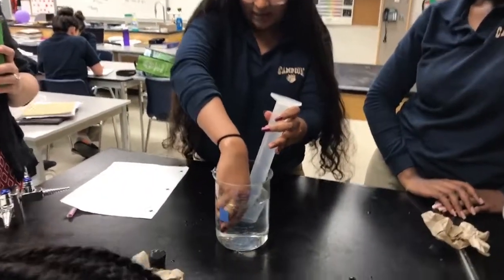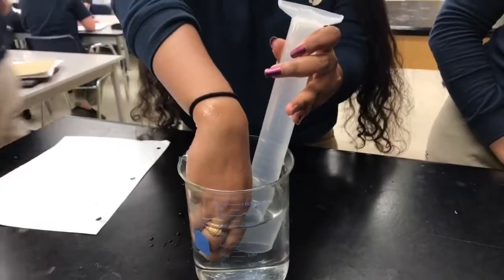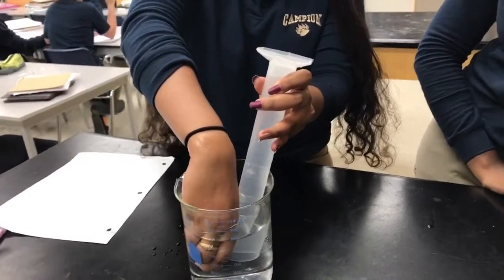Okay, that's one. See the air bubbles going up? There we go, we got a solid stream. We're going for 60 to 70 milliliters, essentially when the water level in the graduated cylinder matches that.